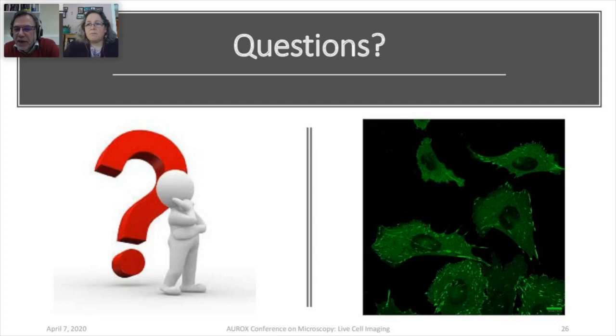Okay. Anything else that you see easily? So there was a question about the software we use. It was the software that came with the oscilloscope. It took a bit of playing around with it. I'd have to look up the details, but my graduate student was quite good at setting it up so we could measure directly into the computer and have the actual output data. It's a little tricky depending on the time window you choose to measure. The data points get averaged over different periods.